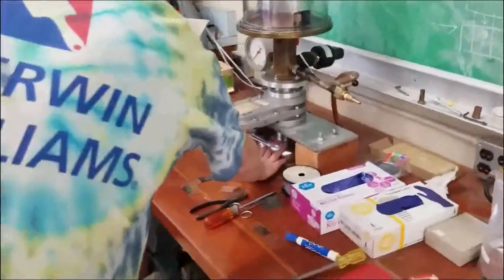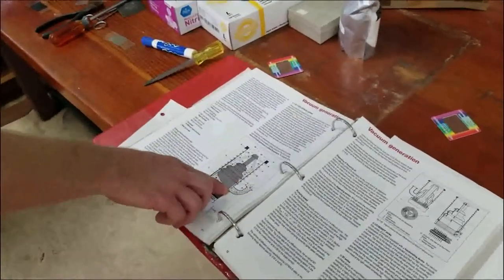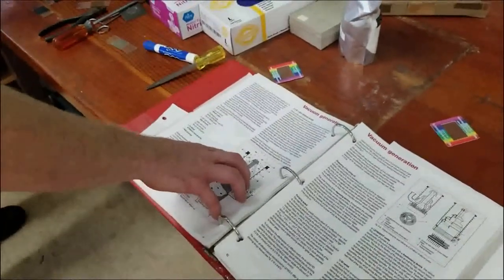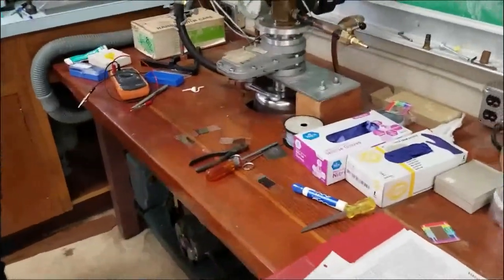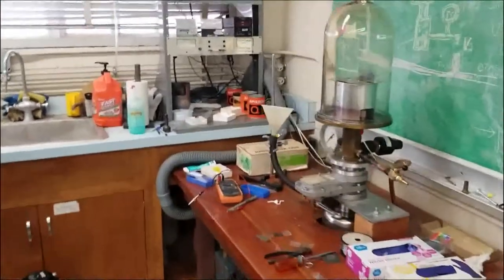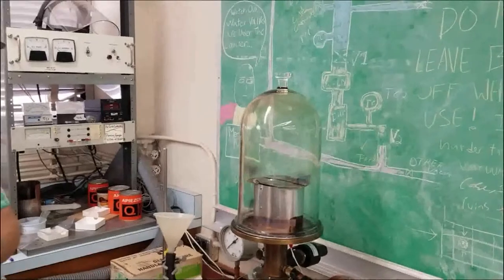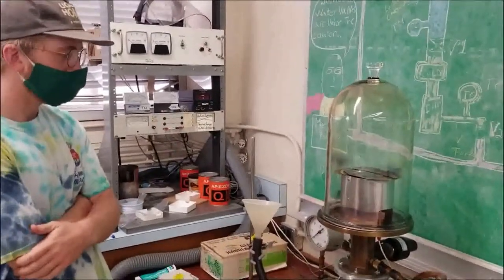So this cold trap that we're going to put liquid nitrogen in, that's actually to keep that from happening. Even if the pressure builds up here, the oil will try to go up but it will just condense on the cold trap and come back down to the sides. And the sides are cooled by water. So when you work this thing, it's going to be kind of intuitive for the most part.